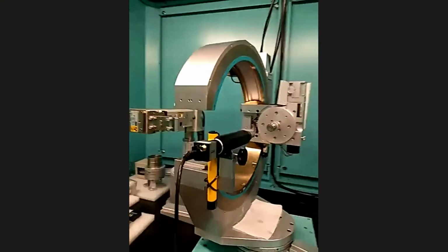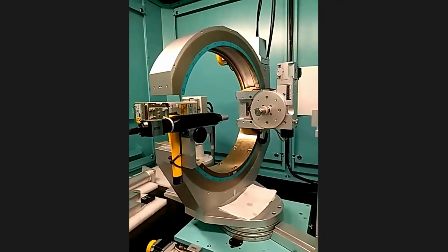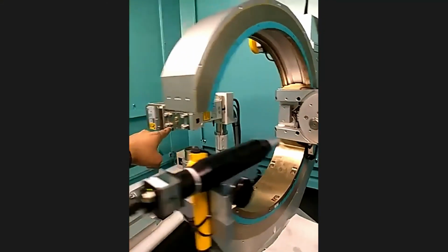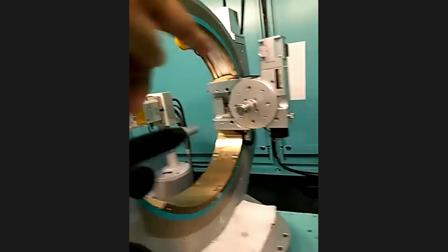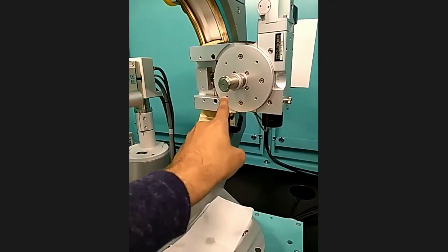You can find the resemblance with the slide image that I was showing. The X-rays come from that hole there. So this is like a copper X-ray generator. And the X-rays hit the sample, which is usually housed here.